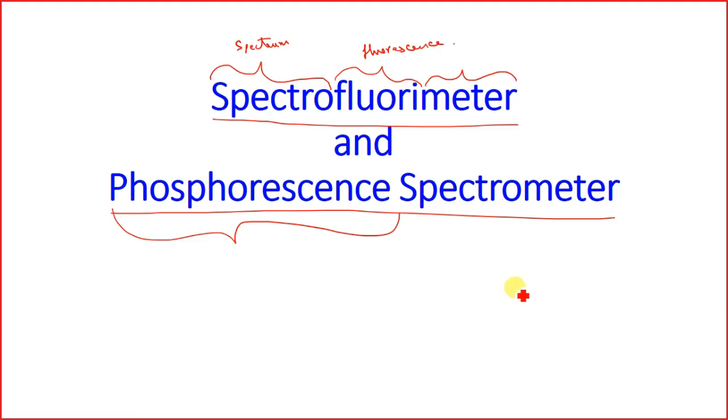Have I been able to make you understand? Suppose this is your gel, and you are having these patterns, right? Suppose you cut this gel part and take it out. You fix a guided LED over here. It will be incident over here, and you'll be getting some transmission. But at 90 degrees, you place an arrangement for recording the spectrum.